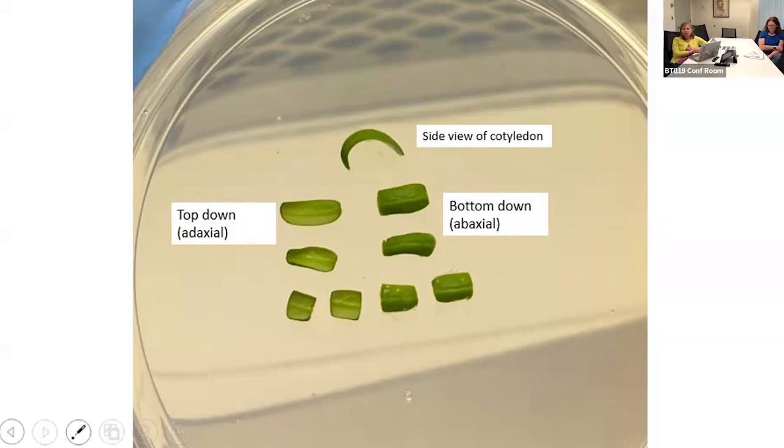Yeah, good question. So that was our earlier method where we were maintaining a tobacco cell line called NT1, the NT1 cells, and we were using that as a feeder layer. That was based on a protocol, a publication, even before I joined BTI. And then at some point we thought, do we really need this? Because we're maintaining this cell suspension, which is extra work. We would maintain the cells in a flask, and we also had the cells as a backup callus in case we infected the cell suspension.